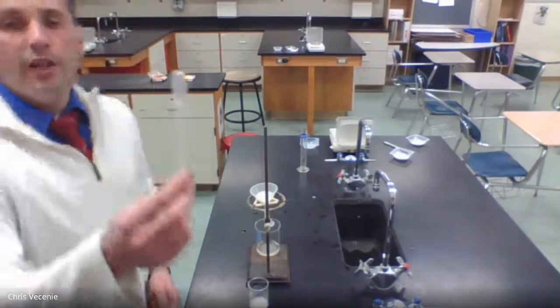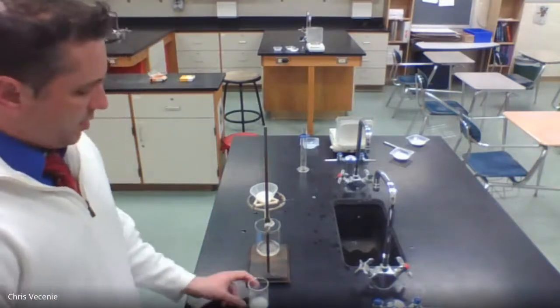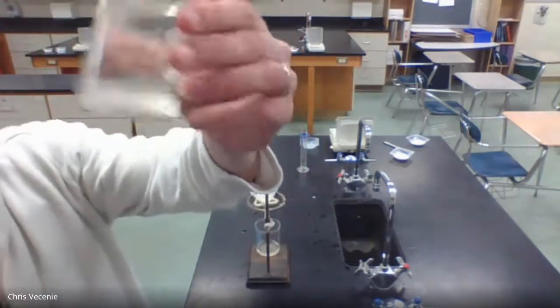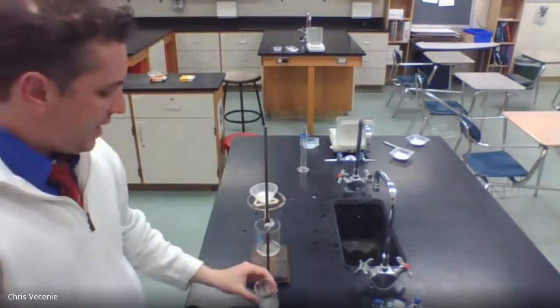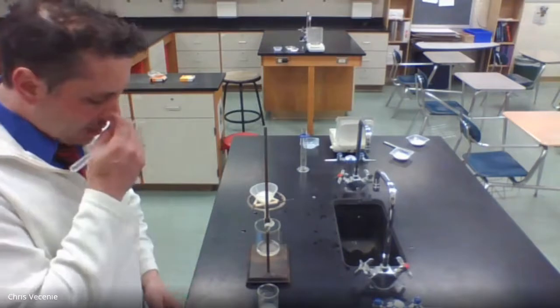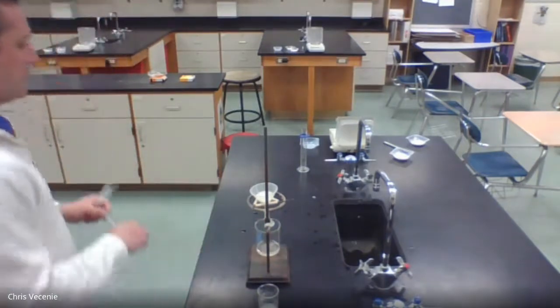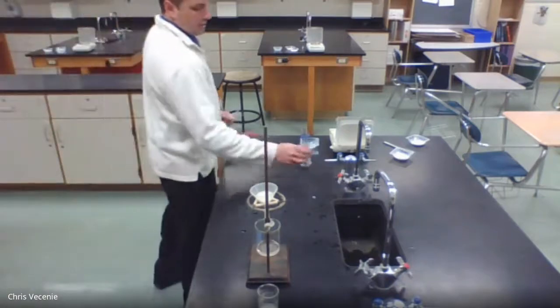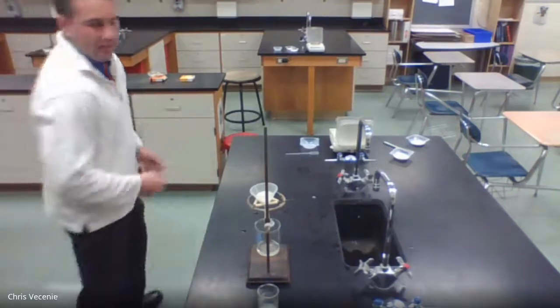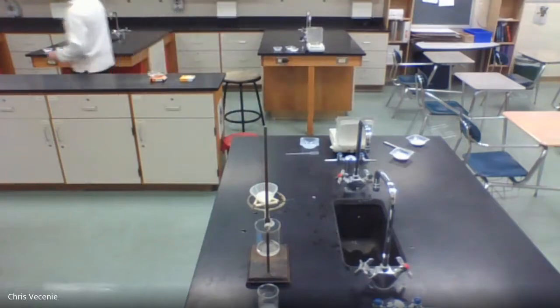What I'm doing now is bringing around a pipette, and the whole idea is when we get close to the bottom here, you're going to see some of that white solid stick to the glass. So the pipette is there to help rinse any of that solid off the glass to try to make sure that we're able to get as much of the product into the filter as we can. So again, this is the long portion of the lab, and I'm just going to keep on filtering while you guys work on problems.